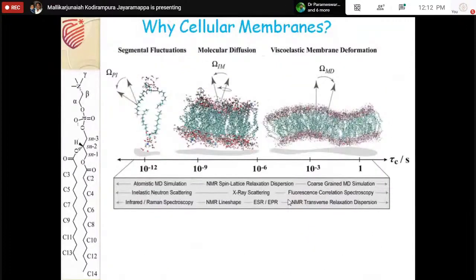You might always be wondering what is the major advantage of solid state NMR, where we are also getting structure, when in X-ray also people are using X-ray extensively for their material characterization. The beauty of NMR here is that X-ray is like a static camera where we get a still photograph. But NMR, along with still photography, acts like a video camera or motion picture.